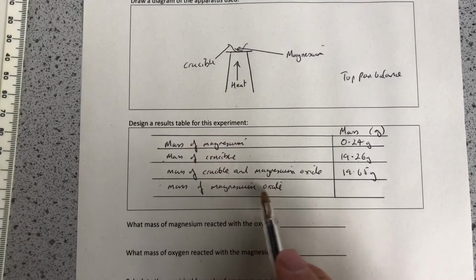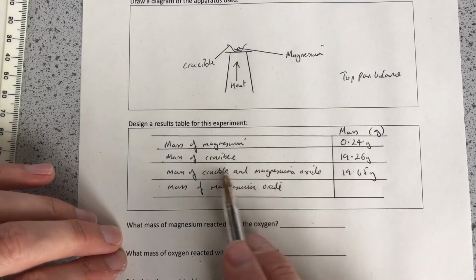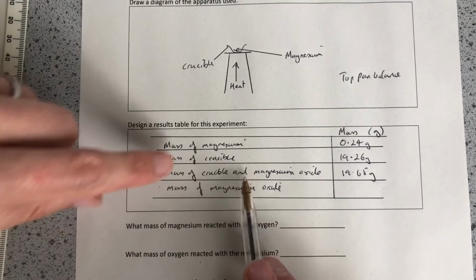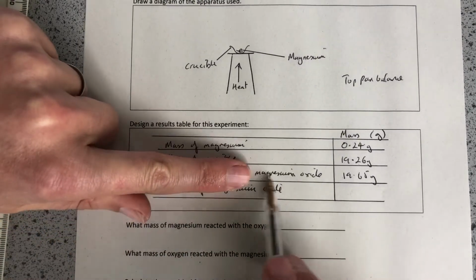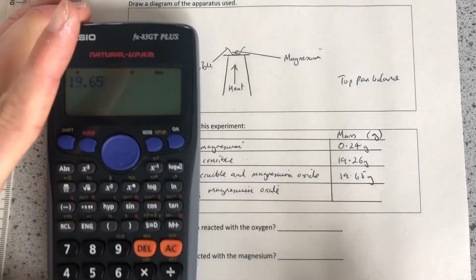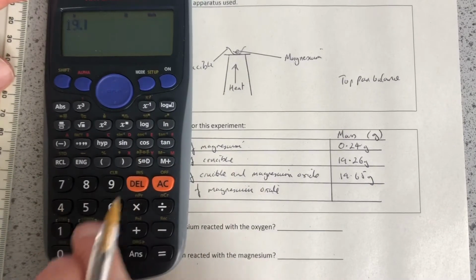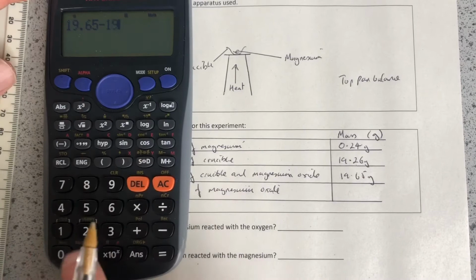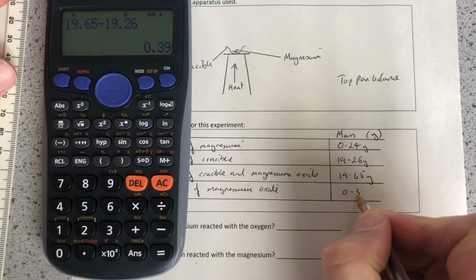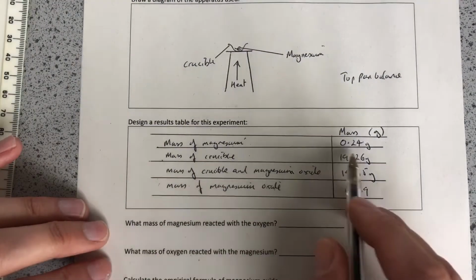So we want the mass of magnesium oxide. To do that, we're going to subtract the mass of the crucible from the mass of the crucible and magnesium oxide. In other words, if we take the crucible off that line, we're left with magnesium oxide. So 19.65 minus 19.26 equals 0.39 grams.